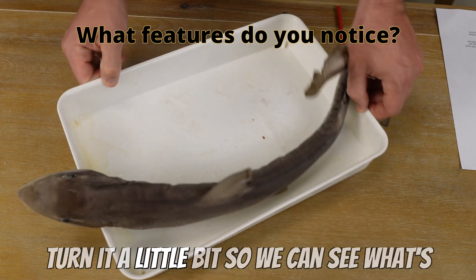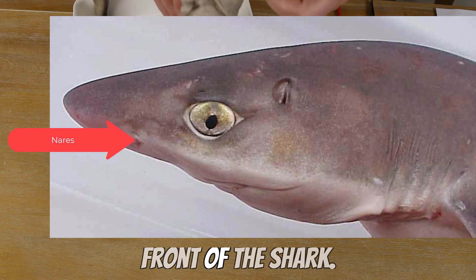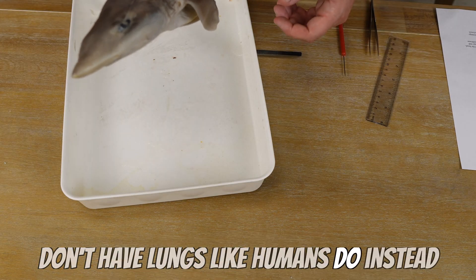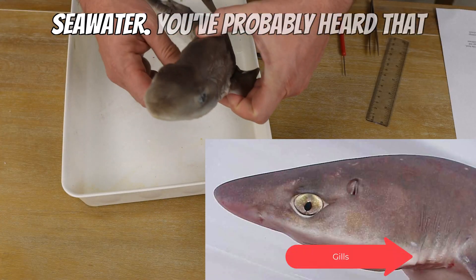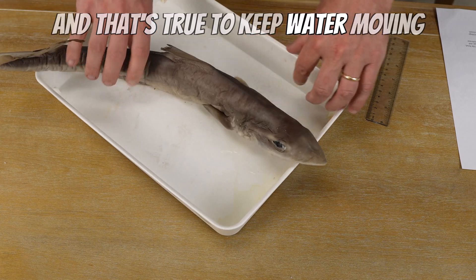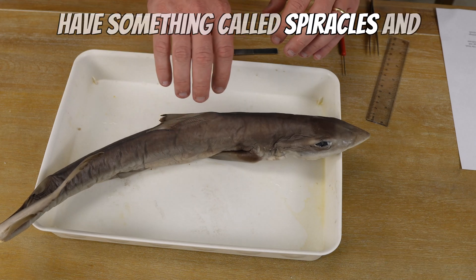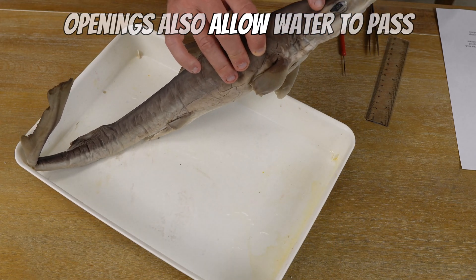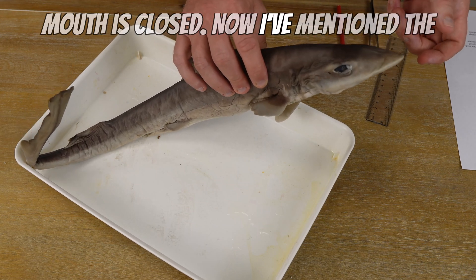If we turn it just a little bit, we can see what's called the nares — these are little nostrils on the front of the shark. Sharks don't have lungs like humans do. Instead, they have gills on the outside, and those gills pull oxygen out of the seawater. You've probably heard that sharks have to constantly be in motion, and that's true — to keep water moving over those gills so that they can breathe. Next, we have something called spiracles, right behind the eyes. These openings also allow water to pass through the gills even when the shark's mouth is closed.